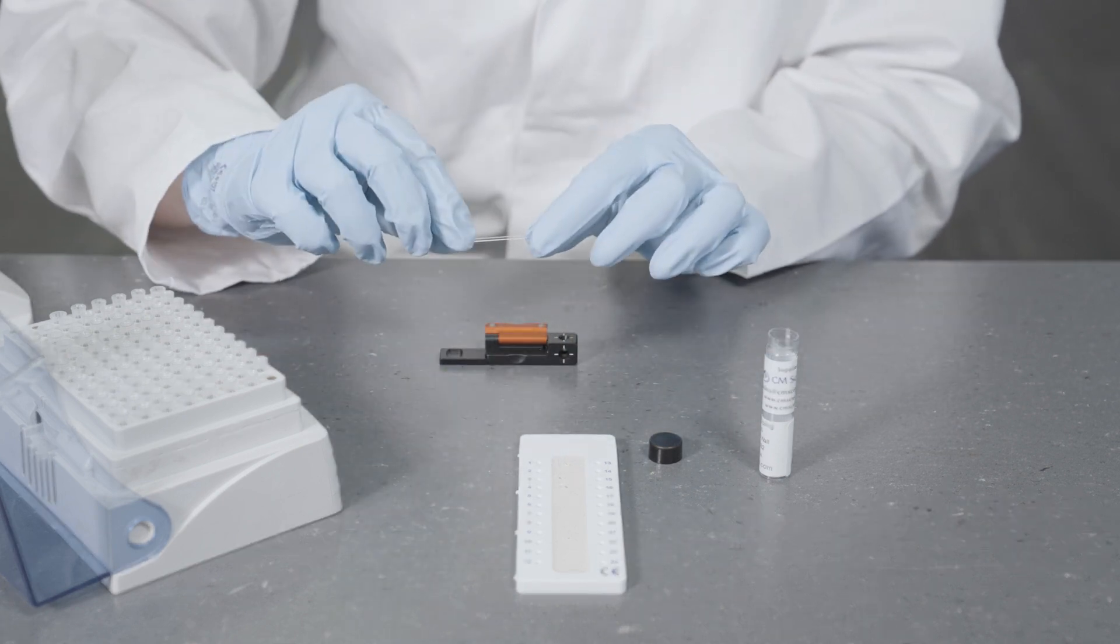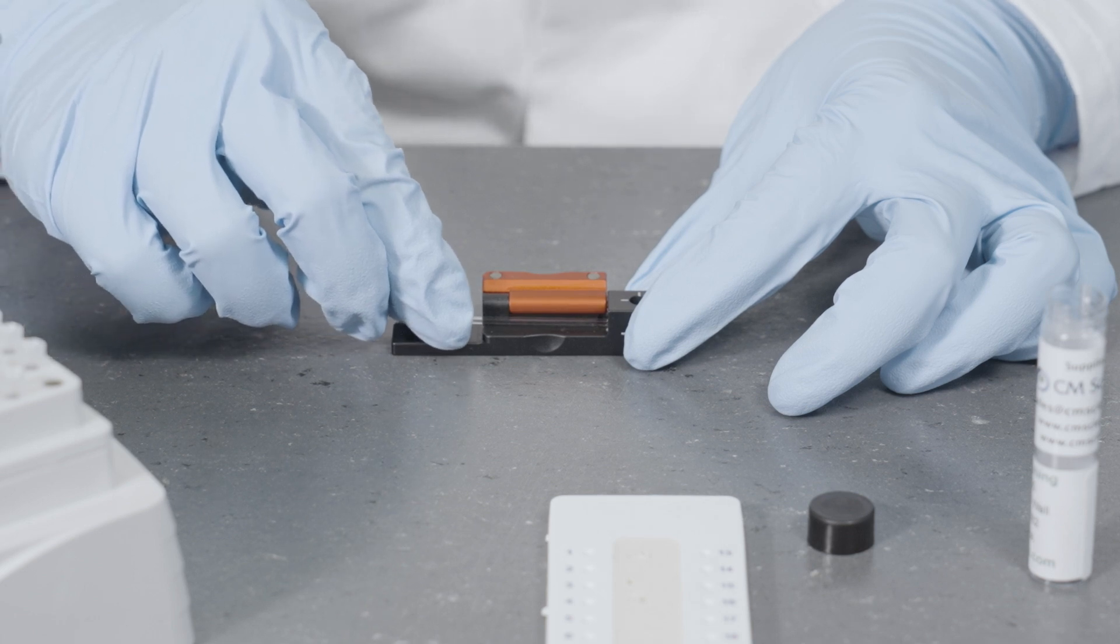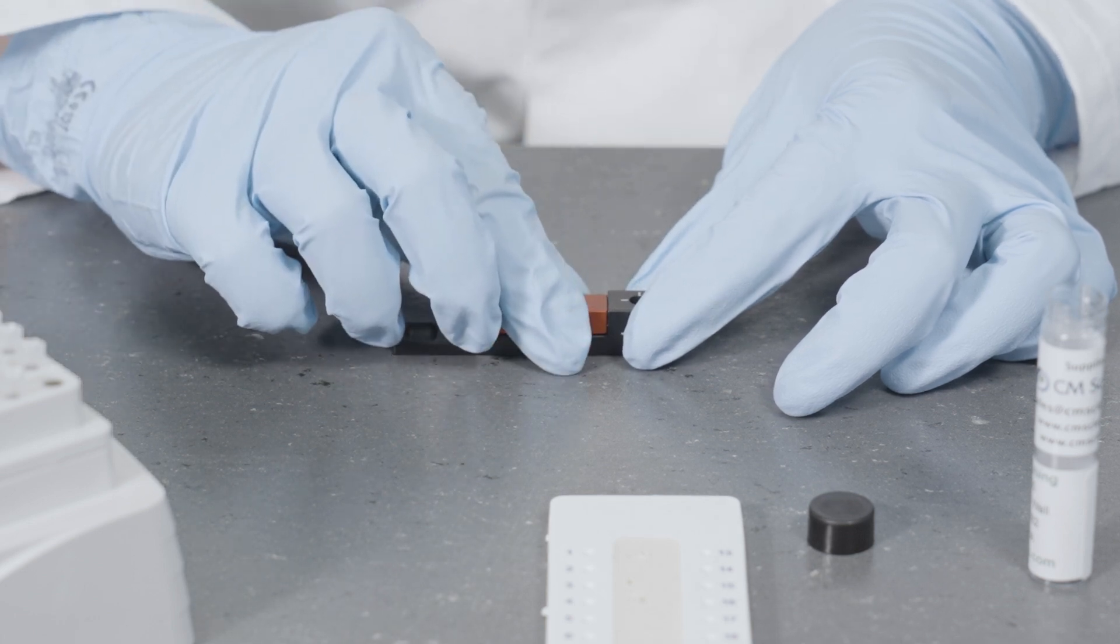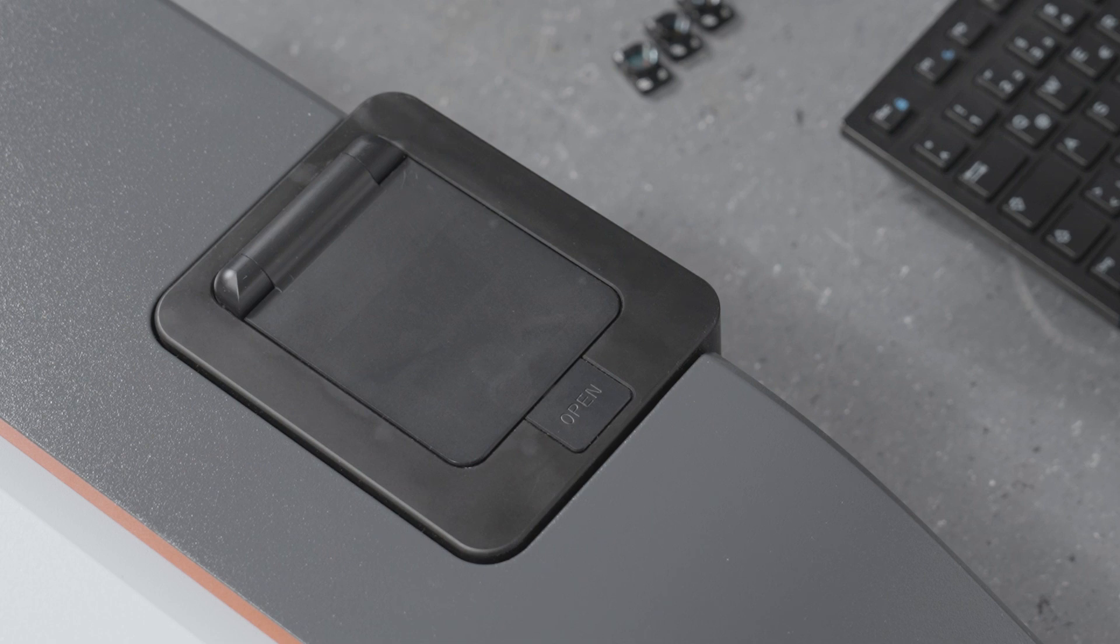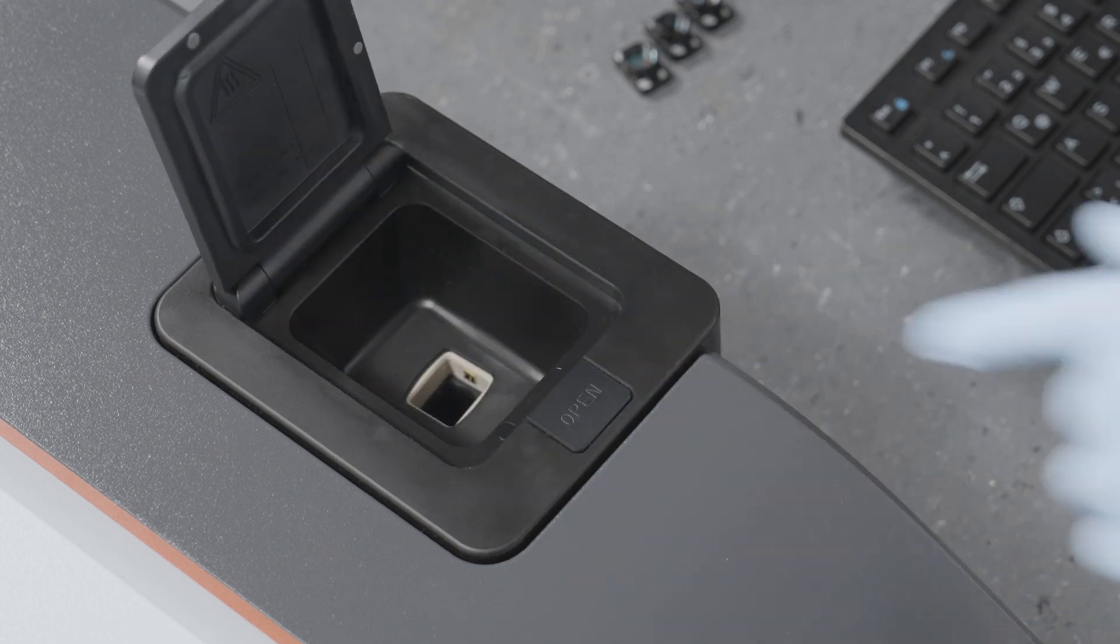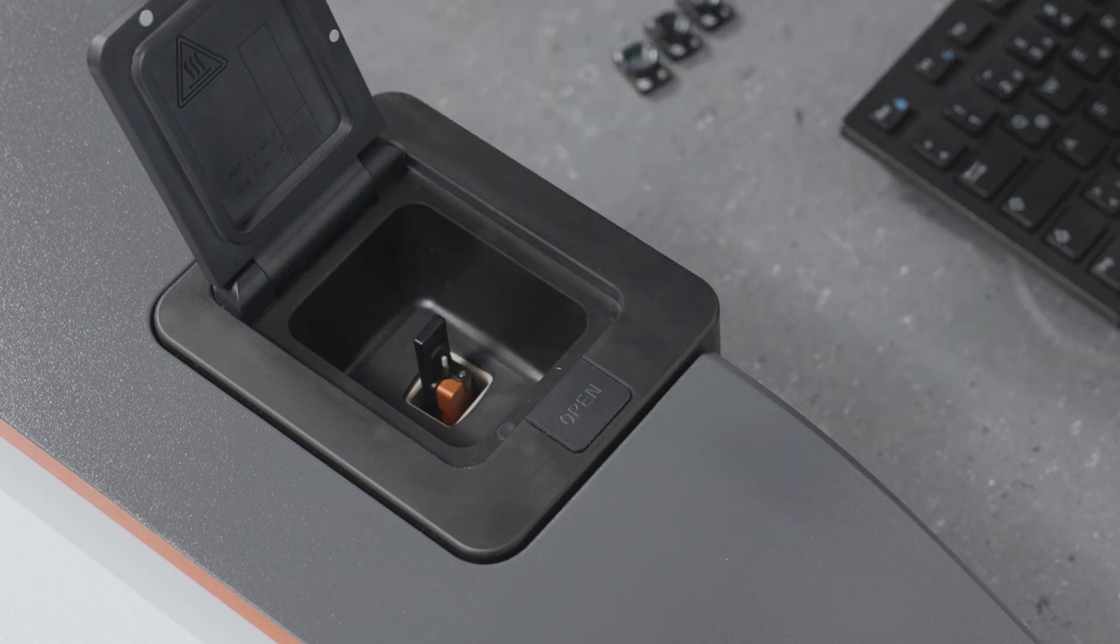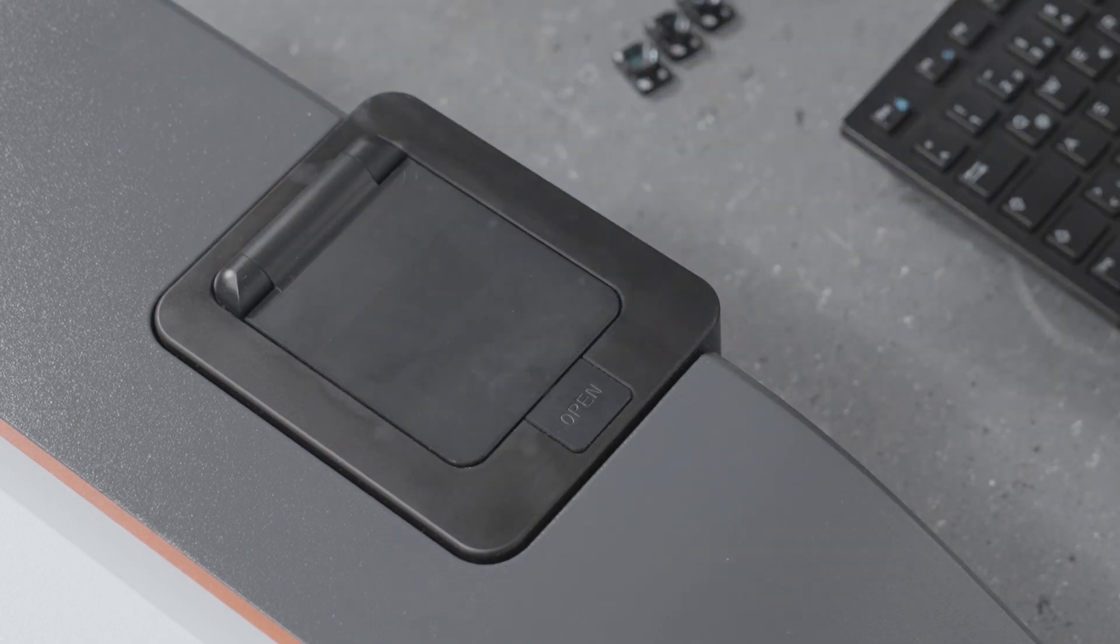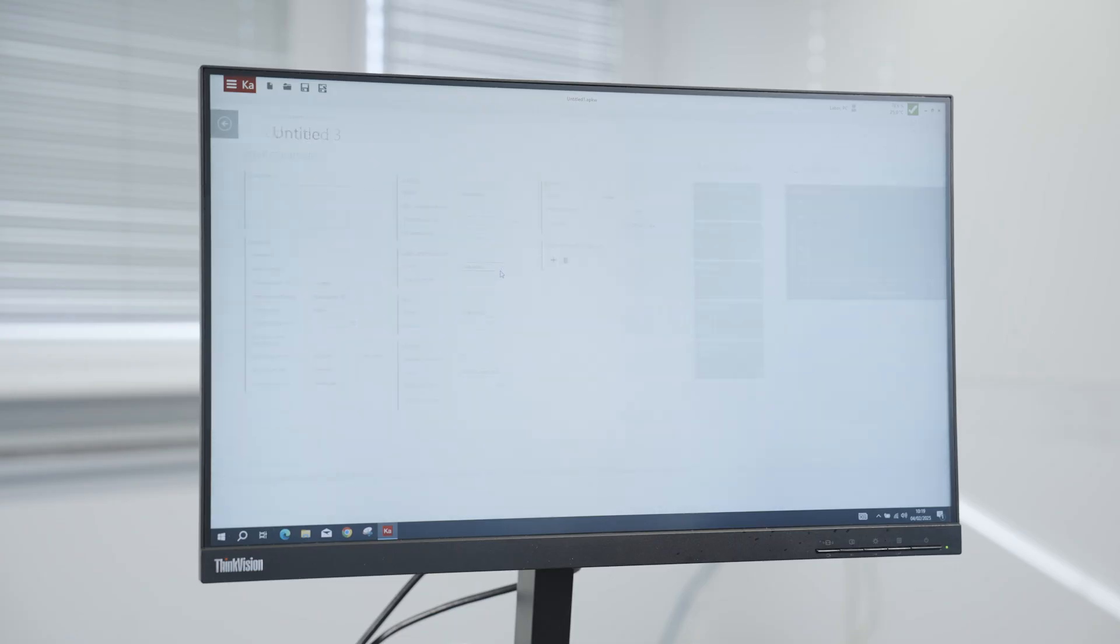Place the capillary flat on the sample holder, then close the magnetic clasp. Start a new particle size measurement and select the parameters.